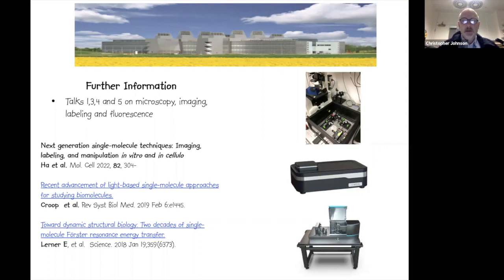Okay, so that kind of answers in some way your question. Just to follow on from that, it's my habit whenever I do SEC-MALS to also take a small amount, because you need so little of the sample, and have a look on the iSCAT to see whether you can measure it and what you see.